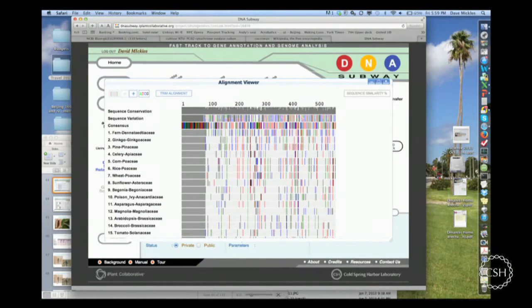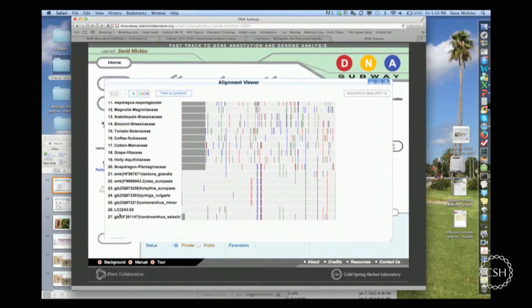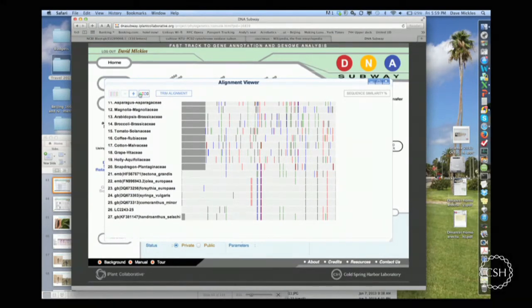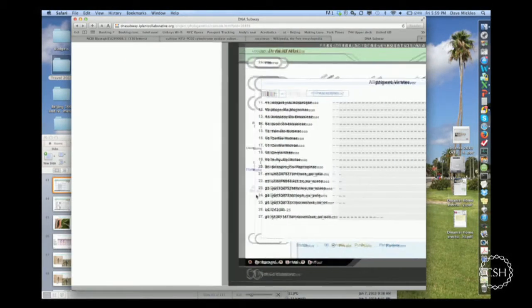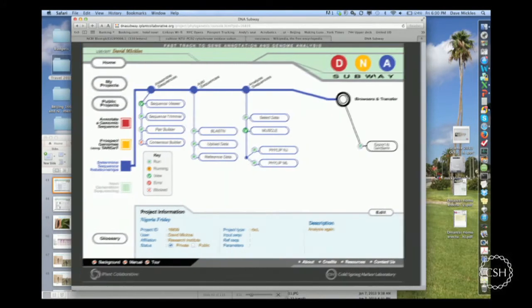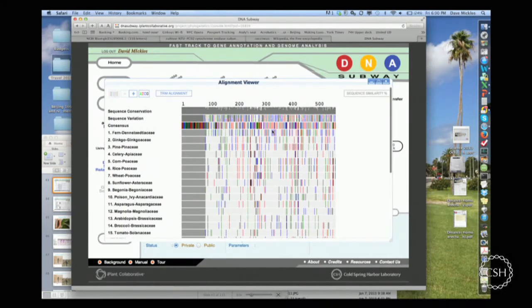And again, I'm looking for my sample here, and there it is. And what you'll see is that, let's zoom in a bit. This is to the base pair level, which is sort of overkill. I've lost that screen here somewhere. Sorry, I just swiped my screen and can't find it again. Okay, well, but here's the analysis again.